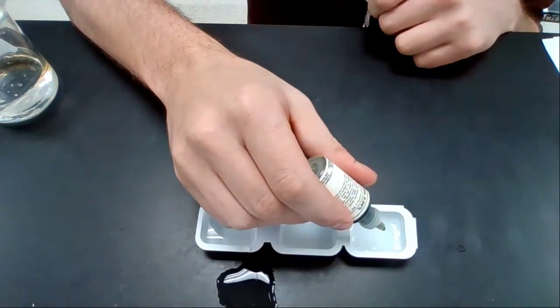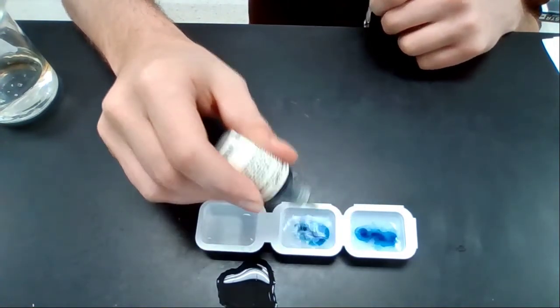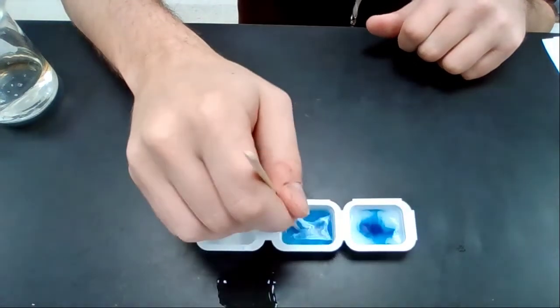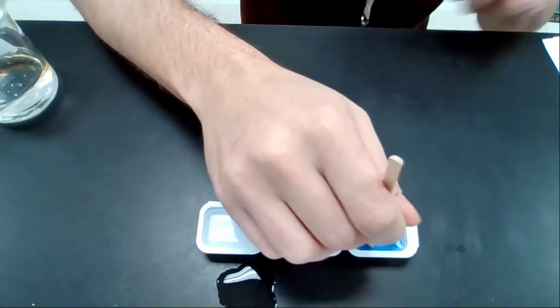So 1, 2, 3, 4, 5, 6. 1, 2, 3, 4, 5, 6. Okay. And we're going to stir that one more time. So we get fairly uniform consistency.